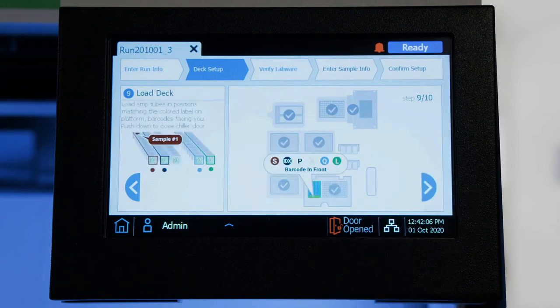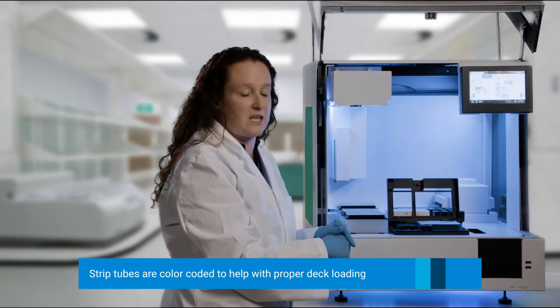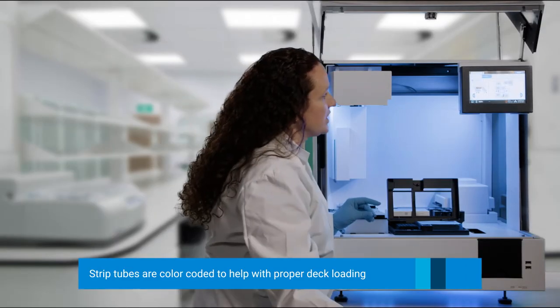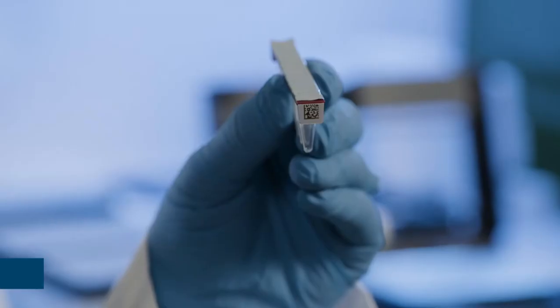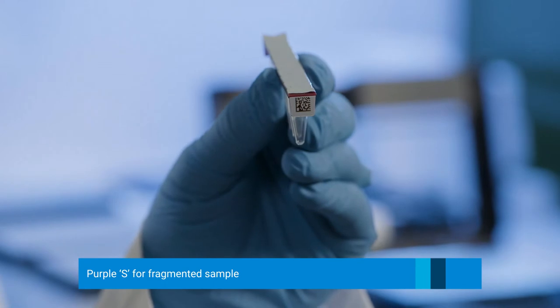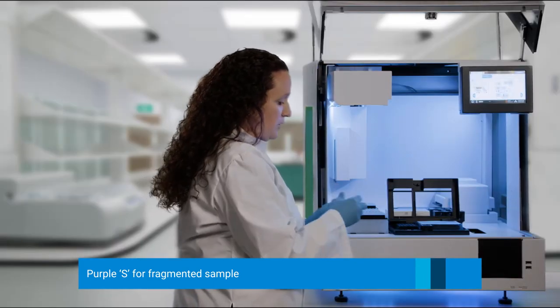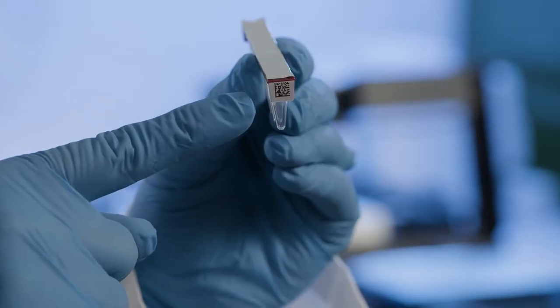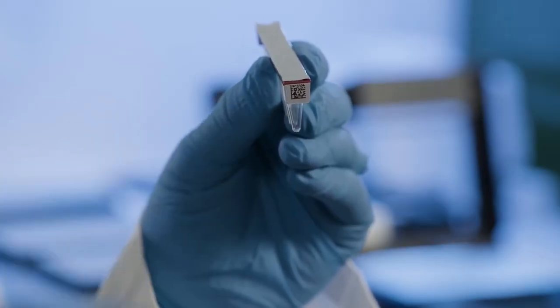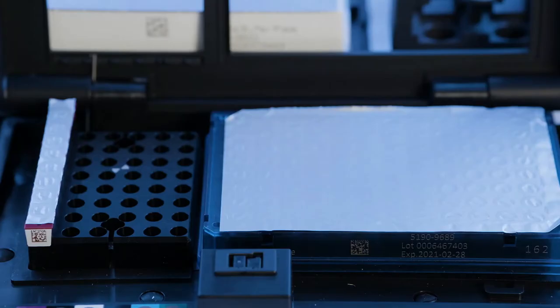Now we are going to click Next and add five of our strip tubes. Our strip tubes are colored based on what type they are. The first thing we are going to load is the S strip — this is where you would put your fragmented sample. The S is purple, and it lines up with the purple indicator on the Magnus. The barcode faces towards you — a common theme; all of the barcodes pretty much face to the front.